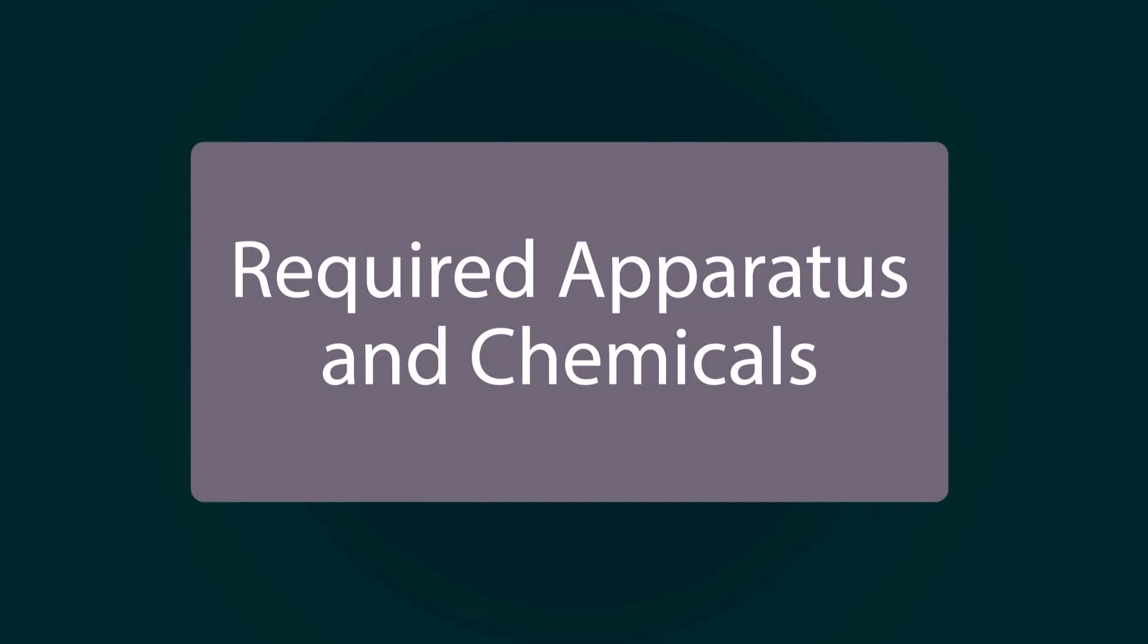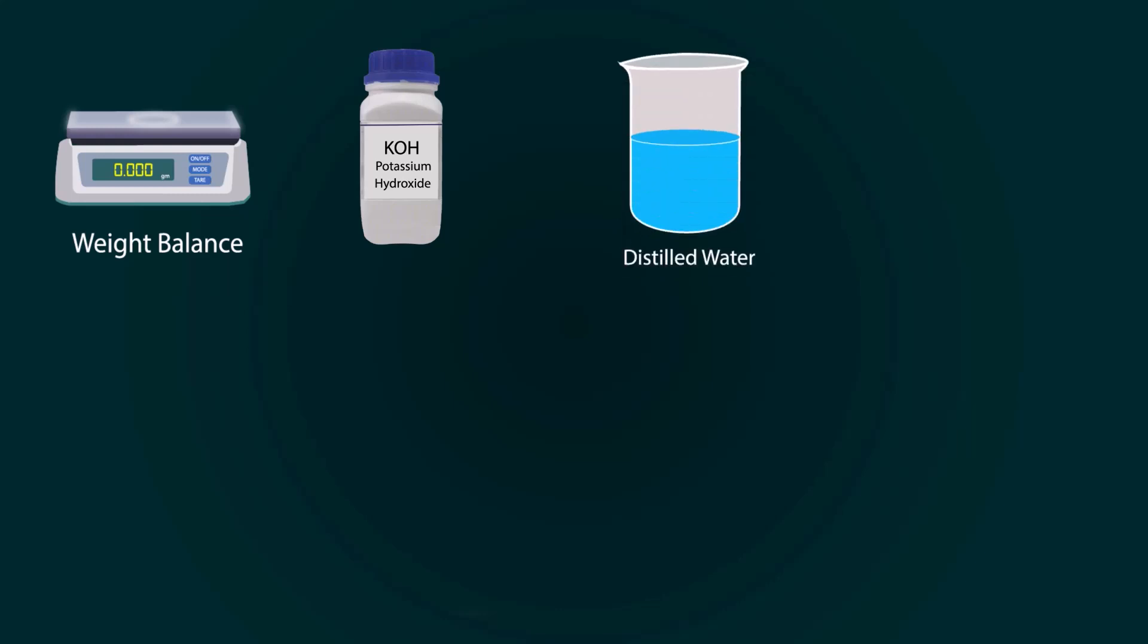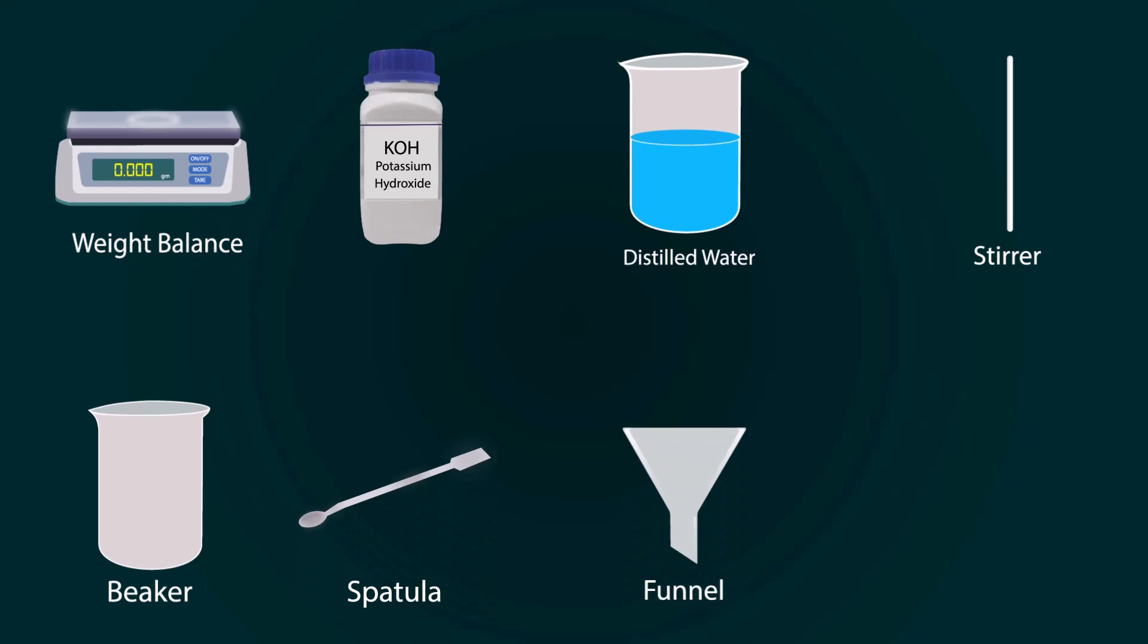Required apparatus and chemicals are: a weight balance, potassium hydroxide, distilled water in a beaker, stirrer, empty beaker, spatula, funnel, and a volumetric flask of thousand milliliters.